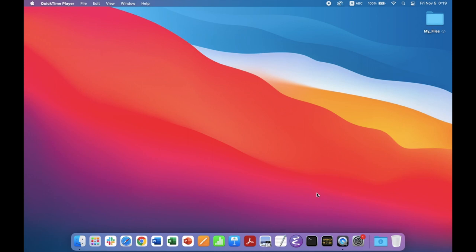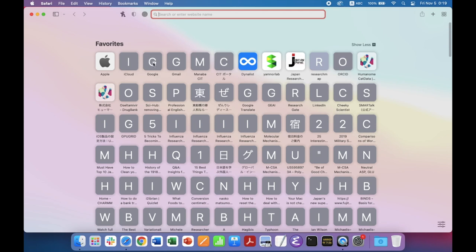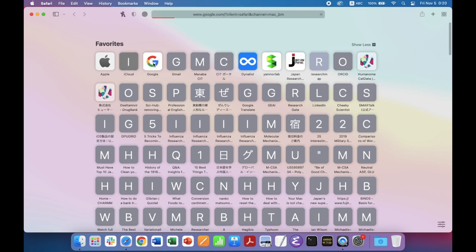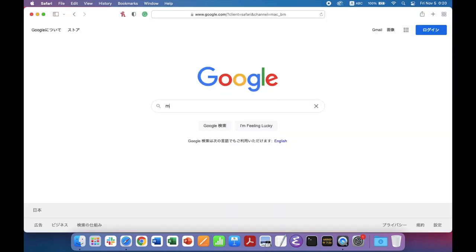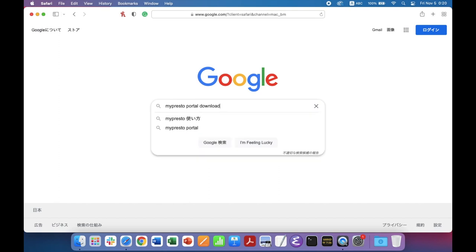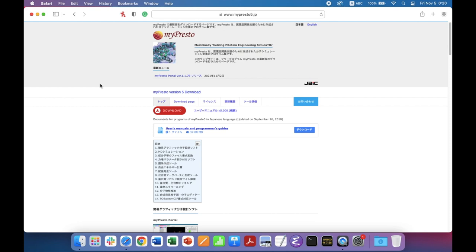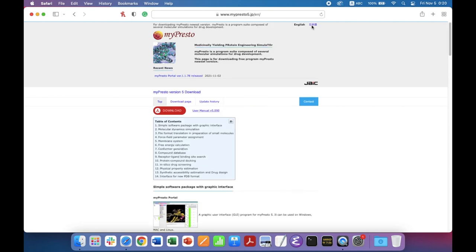This is the tutorial for my Presto portal. First, let's see how to download it. Go to your browser — here I am using Safari — go to Google and type 'Presto portal download'. Go to the myPresto version 5 download page. This is in Japanese, but if you want to see it in English, click here on 'English'. This changes it to the English version.